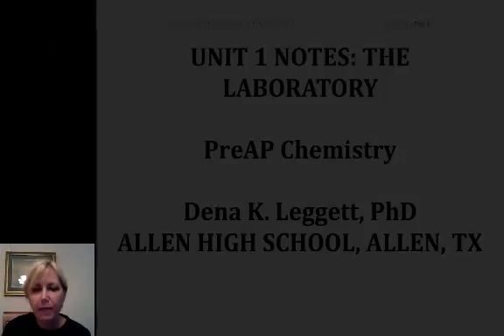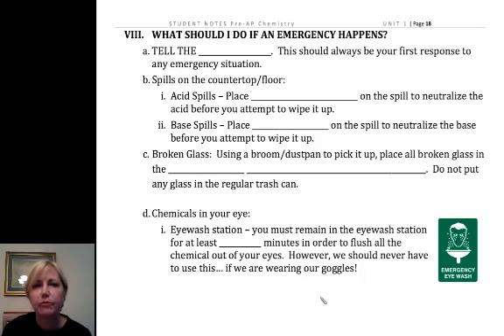Hi, and welcome to Allen High School's discussion of pre-AP chemistry — that's 10th grade honors chemistry — and we're talking about the laboratory and safety in the laboratory.